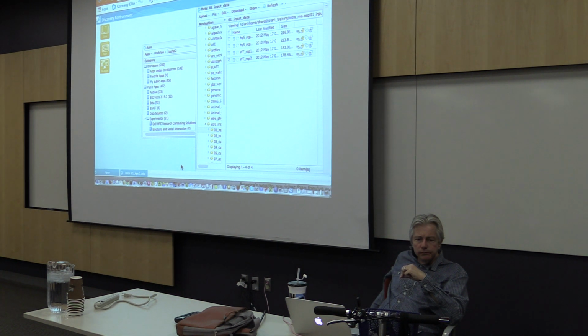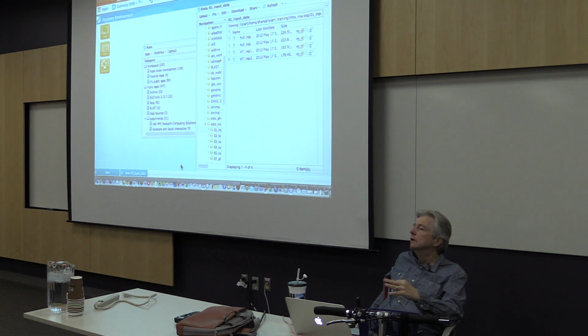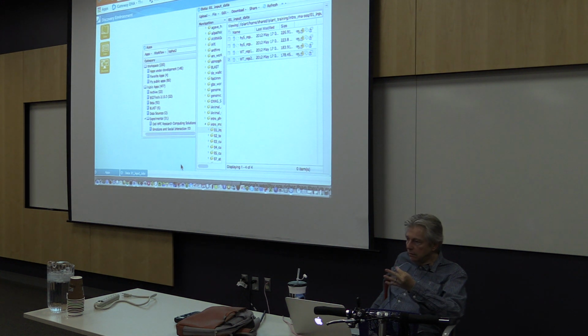Well, the masked genomes, I think some applications will make use of that information, the masking information. And I think TopHat is one of them that can. You may have to set specific options to tell it to use the masking. And the masking, if you don't know, it largely maps out and shows, well, this is all repeat information, and you may not find this very useful for accurately mapping something to the genome.